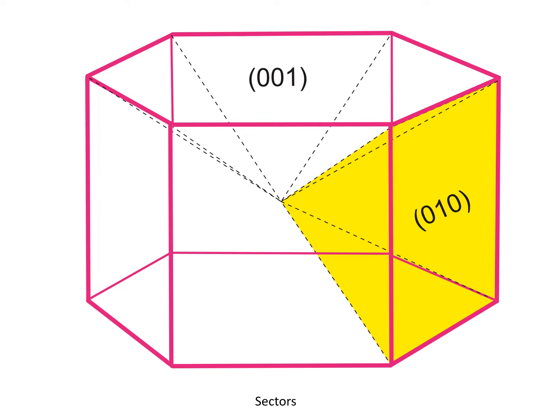So in the diagram here, you see the domain that extends underneath the 010, which is not related to the 001, which also has dotted lines to represent the domain that's under that. So think about there being a difference in affinity for atoms between these two faces. Therefore, they have different chemistries and potentially different zoning.